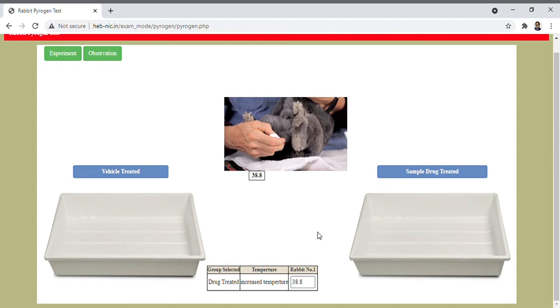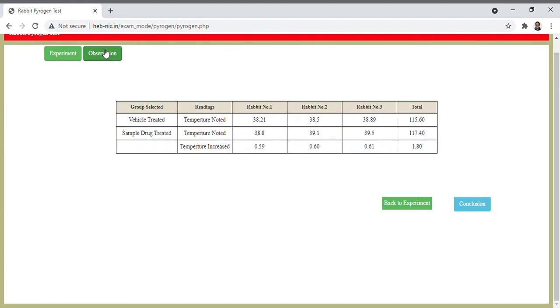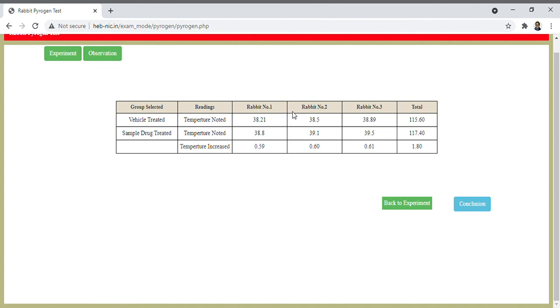Now we see the observation table. In this observation table, in column one we have vehicle treated and sample treated, and in the second column, temperature readings noted in rabbit 1, rabbit 2, rabbit 3 respectively and the total temperature. Temperature increase can be calculated here.